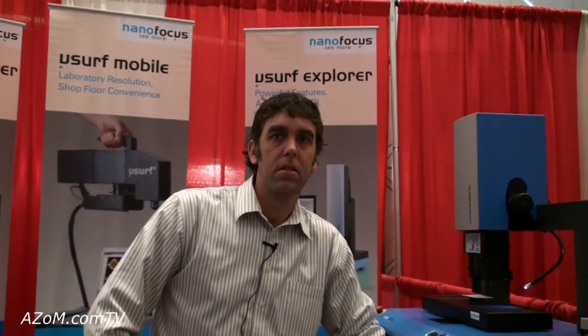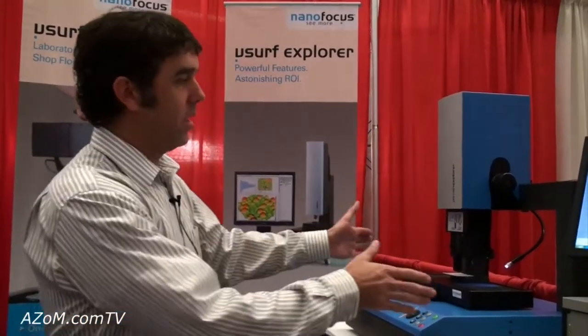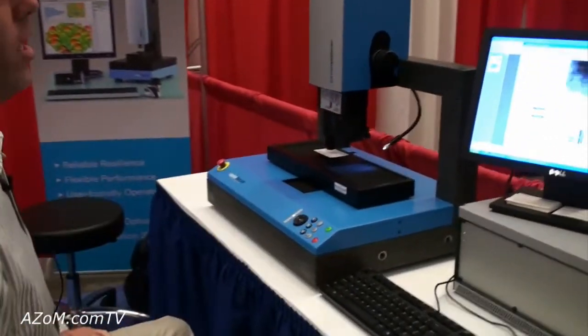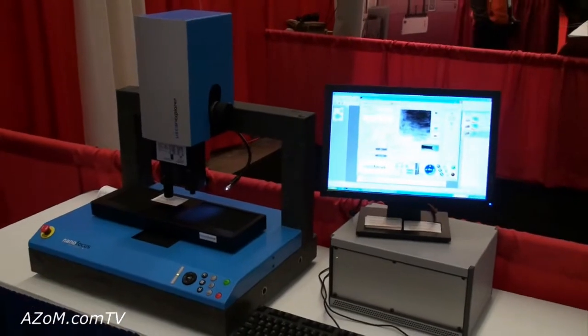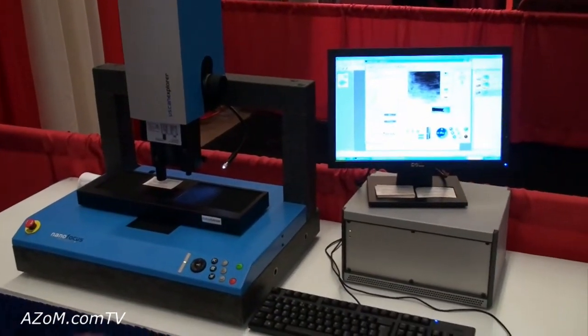This is Cameron Chai from AZoM.com and I'm speaking to Christian Wisher from Nanofocus. He's going to show us their µscan Explorer. This is Nanofocus's newest entry into the surface metrology solutions market, and what this system is is an optical surface profilometer.